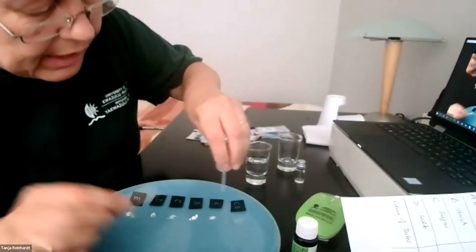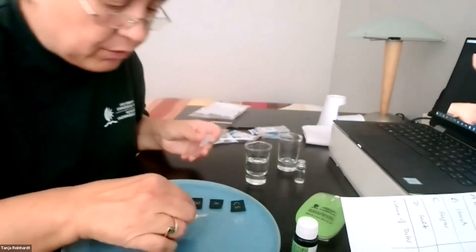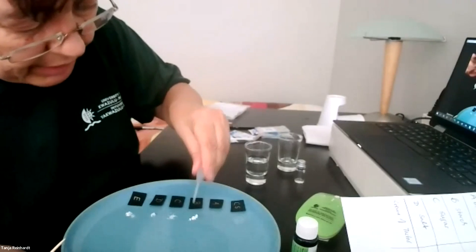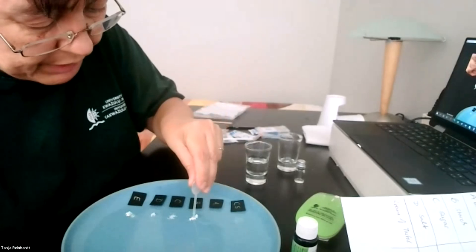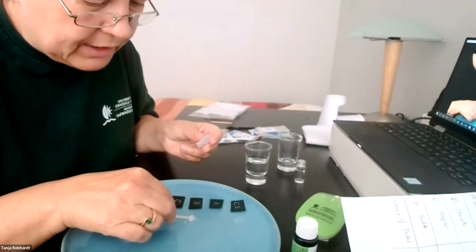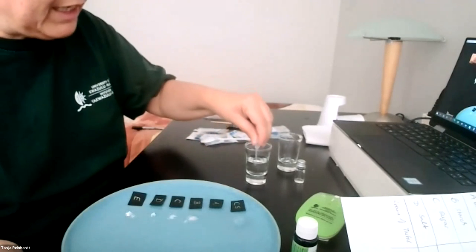So this is the crime scene powder. Now I'm gonna do it with number A. Ooh, this one disappeared, okay? This one most definitely disappeared. Okay, number B. So you can still see the powder here. Okay, so not much change. So it does not dissolve. So B doesn't dissolve.